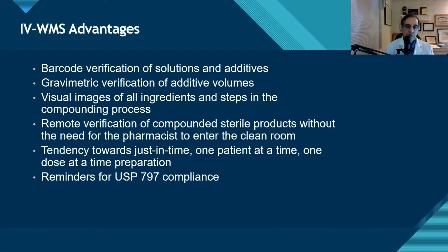The other thing that these systems do is they can have reminders. So as part of the workflow, especially when you're beginning a shift or at different time increments, we can have reminders for our technicians to check filters in our hoods, to check the airflow in the room, to do the cleaning steps that are necessary either for our hoods or for the floors and walls and ceilings. And we can follow all of the USP 797 regulations by getting these little reminders and documenting that those tasks have been done. So a lot of benefits to going with IV workflow management systems.